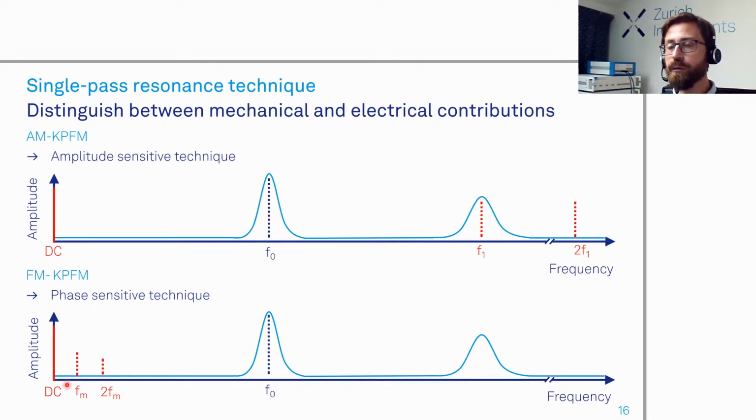We want to have a rather low modulation frequency. When you start to have the mechanical shaking of your cantilever and then you approach your surface, the tip, of course, is going to sense this electrostatic force. It's actually attractive, so it will give some negative shift, but that creates a detuning.